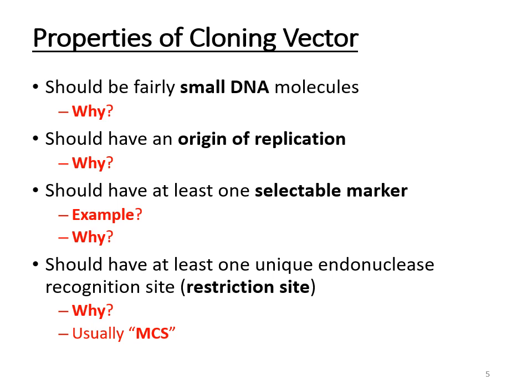Good luck with that, and it's not going to go very efficiently once it's inside of that little cell. So you want the vector to be fairly small DNA, to help it get into the bacteria.